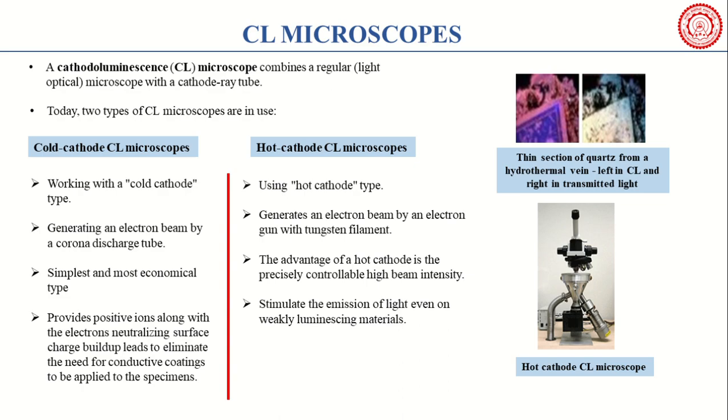Here is the image of a hot cathode CL microscope being used, and here is a thin section of quartz from a hydrothermal vein. The left image is of CL and the right is of transmitted light.